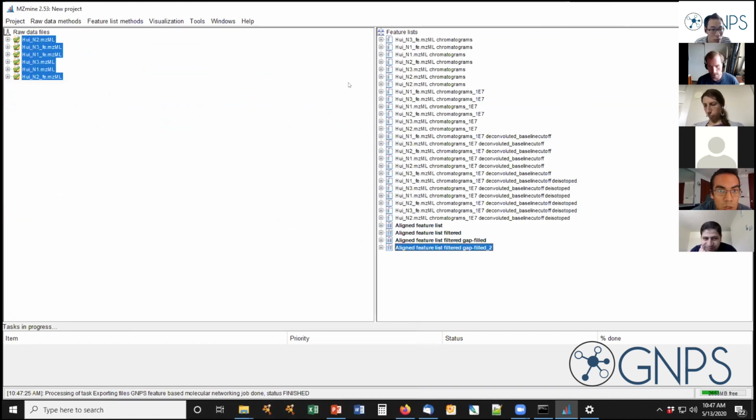So independently of whether you made it till there today, or for people who could not attend today, we will provide that material for part 2 of the workshop. And I think for now, that's it with the MZmine step-by-step tutorial. And I would say let's go to breakout rooms and have more informal discussions.